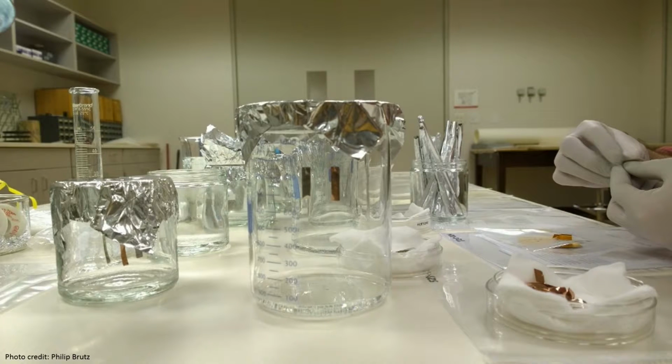3 types of metal are used as coupons because each has a higher propensity to corrode in the presence of a different pollutant. In this way, the Oddy test can check for the presence of a wide variety of pollutants. The copper coupon detects the presence of chloride, oxide, and sulfur compounds. The silver coupon detects the presence of carbonyl sulfides and reduced sulfur compounds, and the lead coupon detects the presence of organic acids, aldehyde, and acidic gases. The lead coupon is excluded from the accelerated Oddy test because it would likely corrode in the higher temperature environment of the accelerated test vessel, regardless of the presence of pollutants.